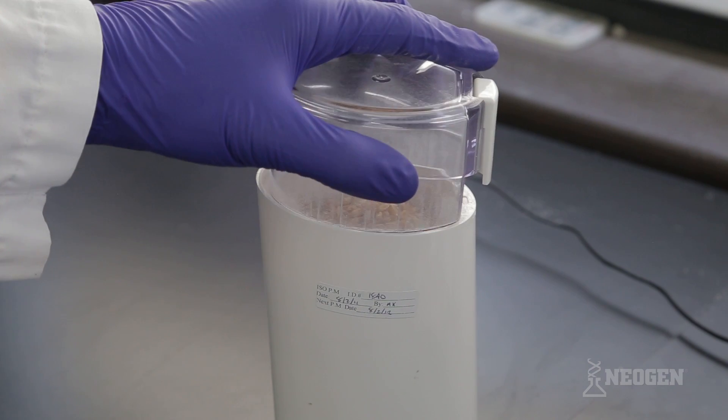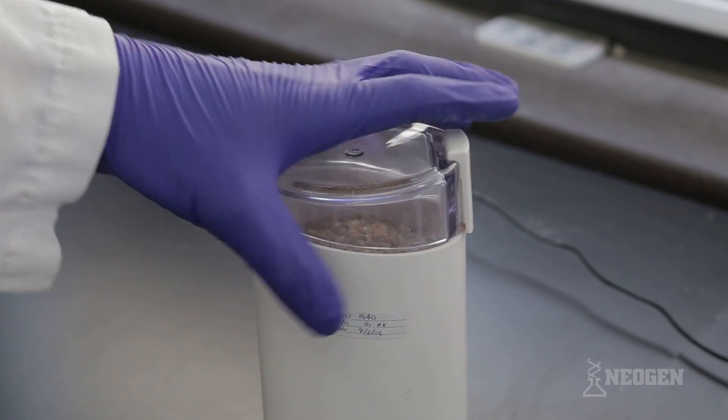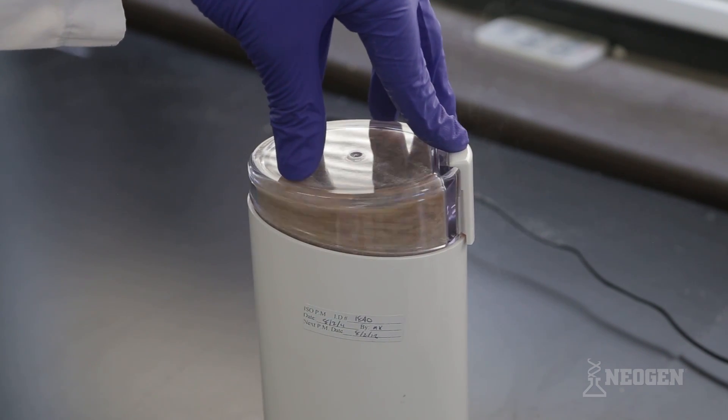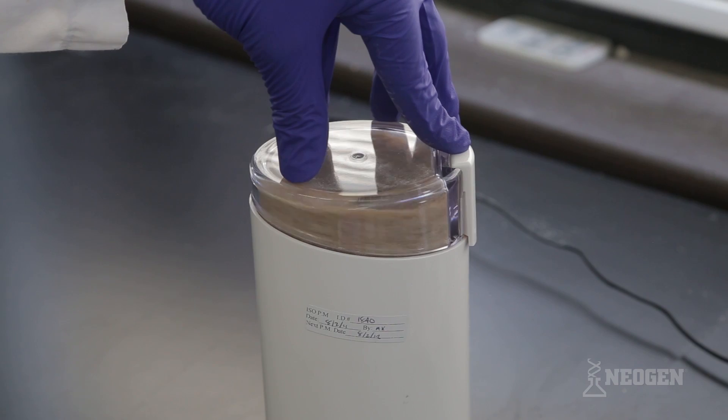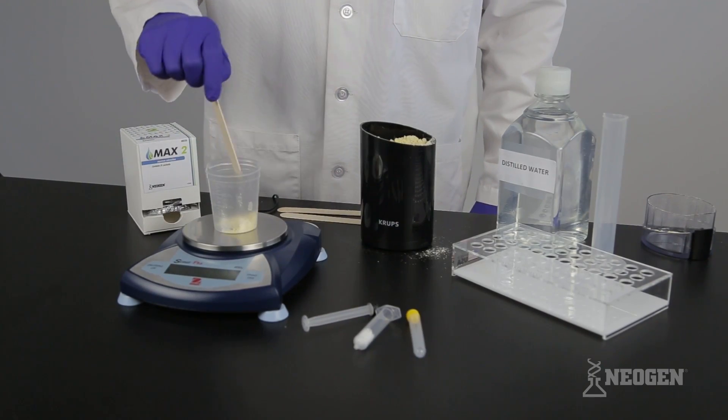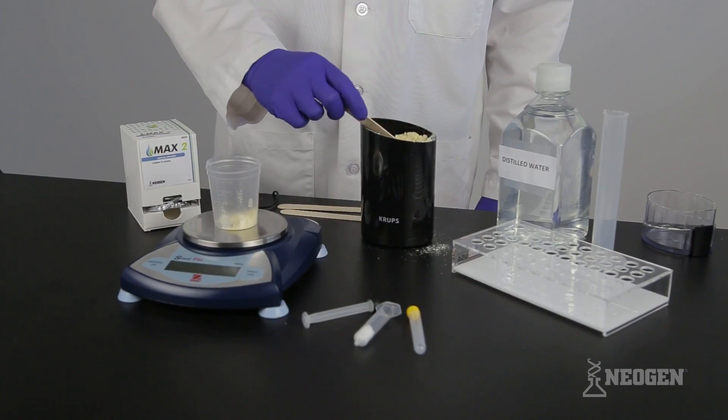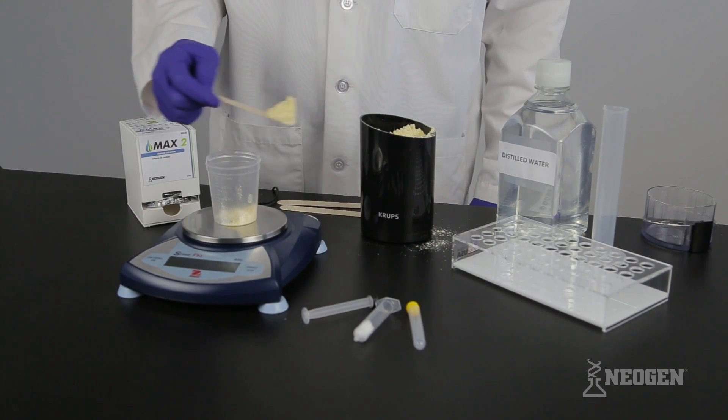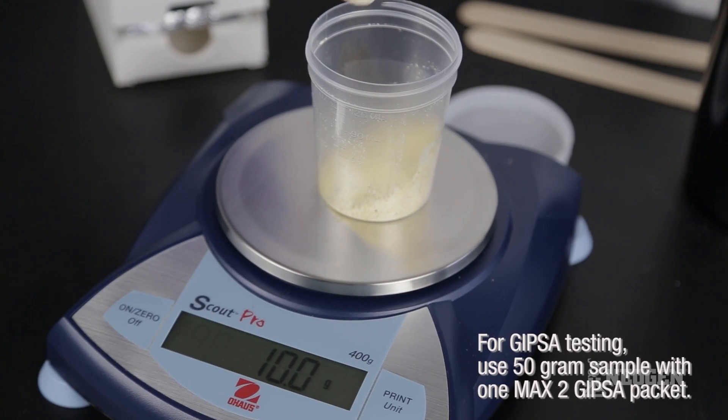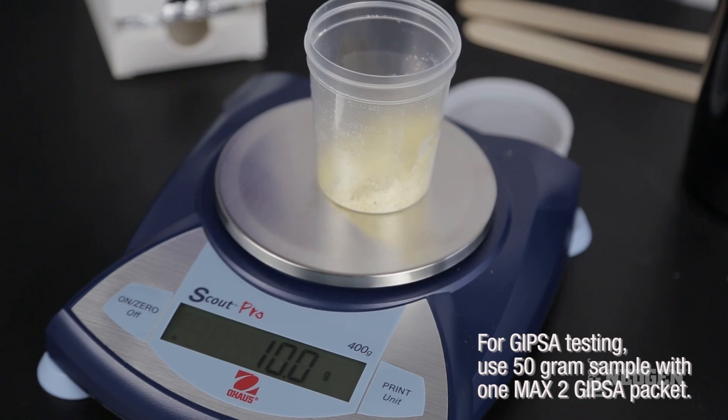Obtain a representative sample and grind so that at least 75% of the ground material passes through a 20 mesh sieve. The particle size should be about the same as instant coffee. Grind a minimum of 100 grams of your sample. Weigh out 10 grams into the sample cup, plus or minus 0.1 gram.